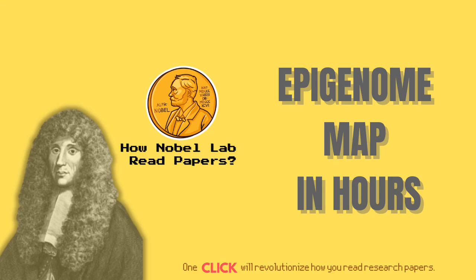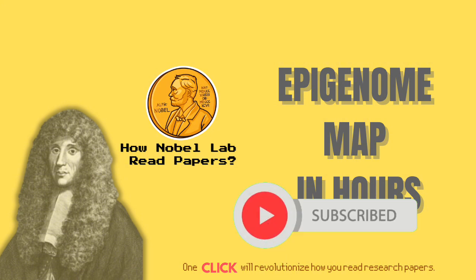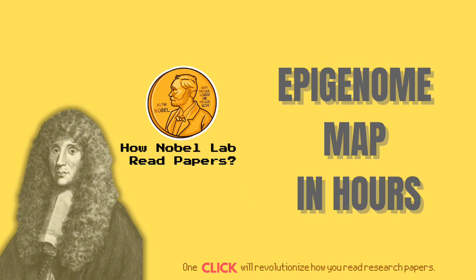Today we're digging into a really foundational paper from 2013, the one that introduced ATAC-seq. That's right. And the core idea, maybe the most surprising thing, is how it took these really complex multi-day methods, like DNase-seq, FAIRE-seq, methods that needed tons of starting material, millions of cells sometimes, and replaced them with this, well, incredibly simple two-step protocol. Simple, same day. And it works with, what, like 500 cells? Which is just wild.